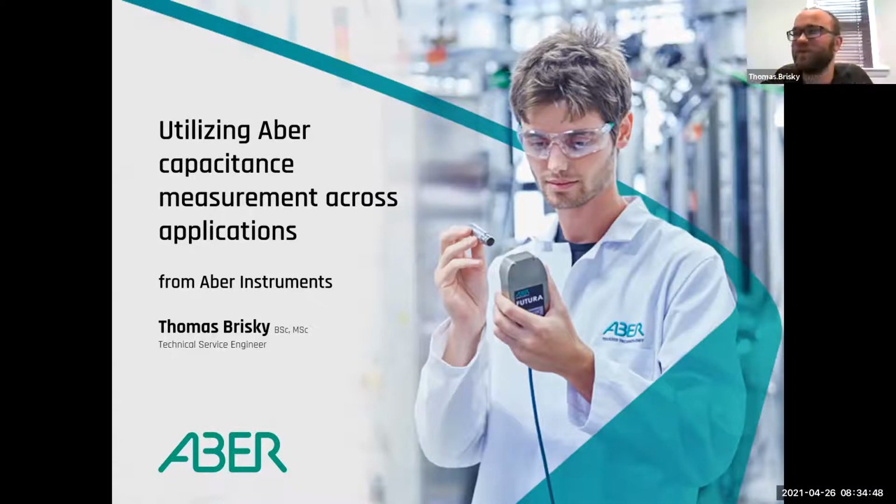Welcome. Yep, thank you. So I'm here to present to you the Aber technology. As Doug mentioned, I'm Thomas Brisky. I'm a technical service engineer for Aber Instruments. My background is engineering and health sciences, but I lucked into getting into this field, which is a great field to be in. It's a pleasure to be here, and so today I'll discuss how Aber uses capacitance to measure viable cell volume and density across various applications.